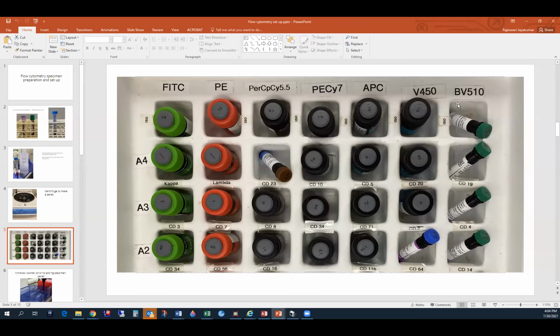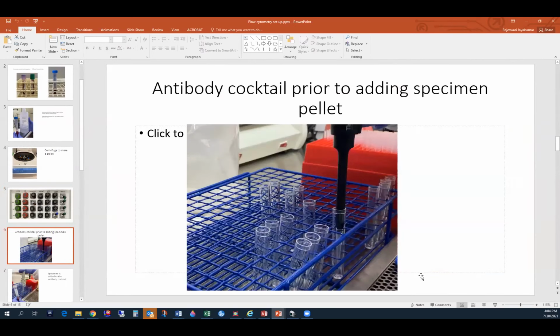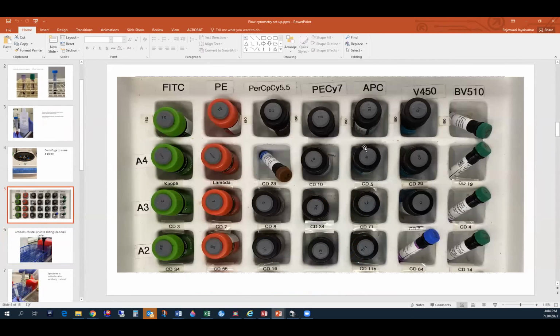That is detected by the detector in the flow cytometer, which converts it into a pulse, and you then get events that are either positive or negative for that particular fluorochrome excitation. Any questions about the fluorochrome or what happens with the antibody so far?